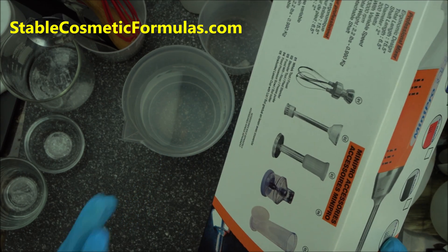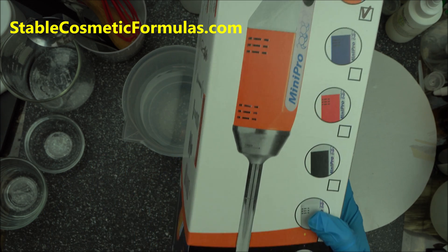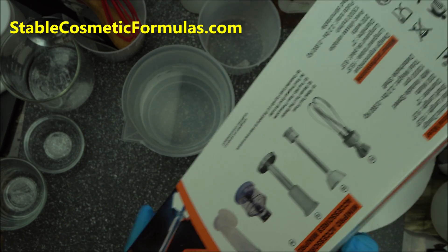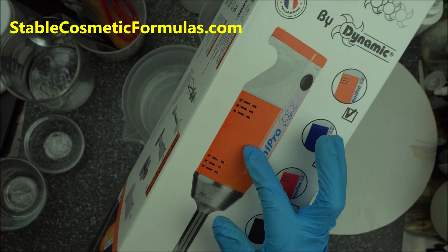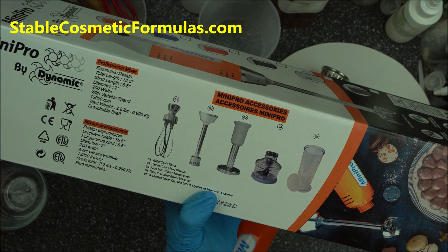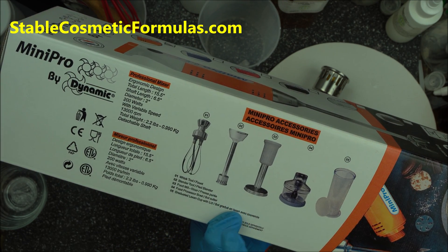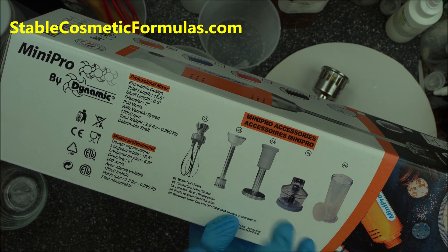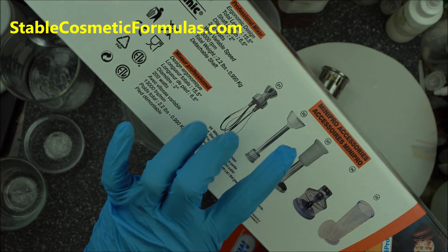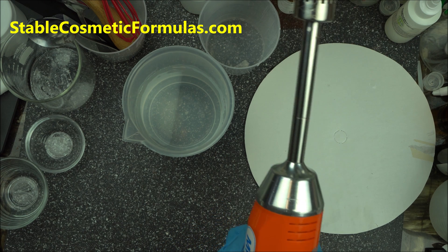As a cosmetic formulator, the head you need does not come with this package. The only reason you're buying this package is for the bottom part — this homogenizing head. This homogenizing head is what you need to blend your gum, homogenize your lotion, your cream, and so on. When I got this, I removed the first attachment and put the homogenizer head on.